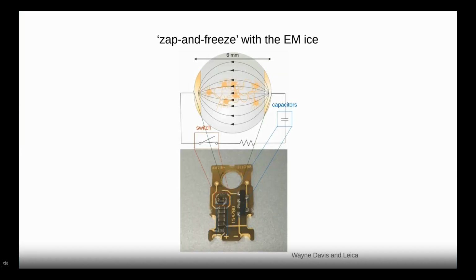And really all this requires is just a few extra add-ons to your high pressure freezer. You just need this light stimulation system that shines the LED in, like with flash and freeze. And then you just need a charging system that charges these little middle plates that you get, that work much like any other kind of setup that you would have for high pressure freezing. And this enables you to electrically control your electrically excitable cells.